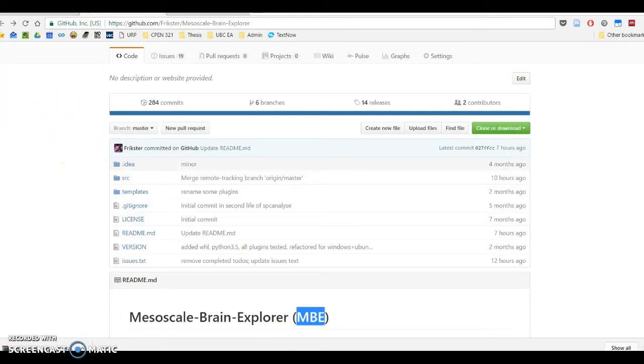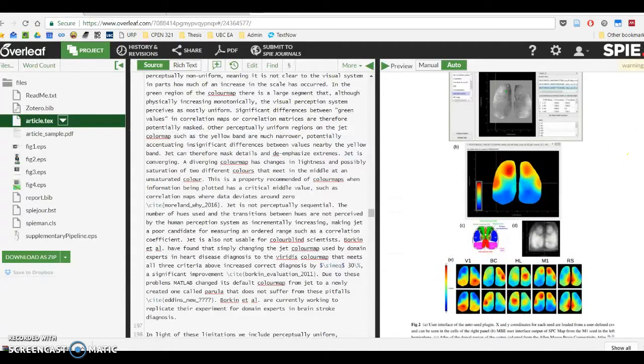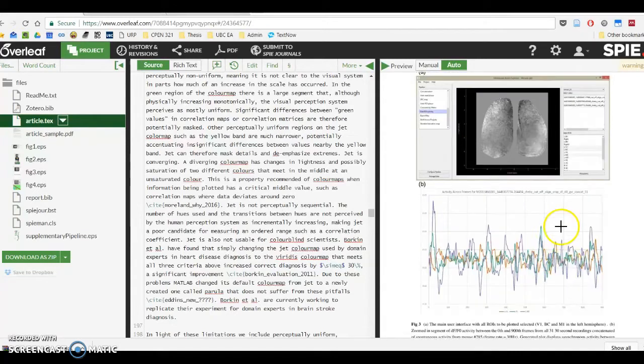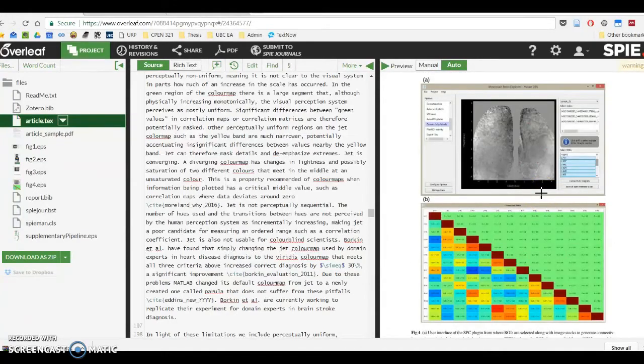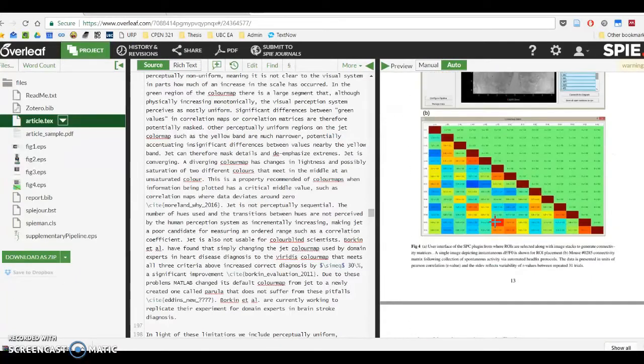In this quick tutorial, I'll show you how to set up the application and get going straight away to replicate the findings that we have in our paper, the paper that was published on this application. So the seed pixel correlation maps on the right, as well as the accompanying graph that shows activity over time for particular regions of interest, and the connectivity matrix. We'll also use the exact same data, or some of the same data that was used to produce these visualizations.